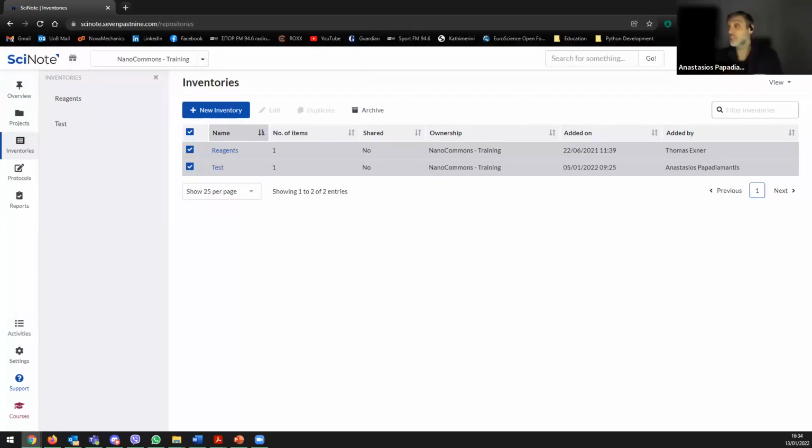All the results we save from the instruments are saved in our personal space at the University of Birmingham, so that if a hard disk fails on an ICP or ES, you will not lose any data. True story, it has happened, by the way.